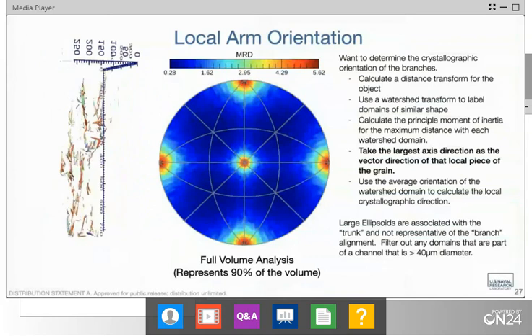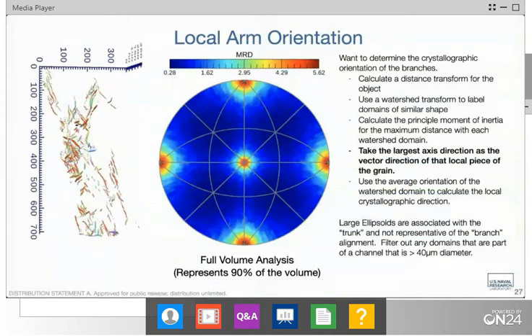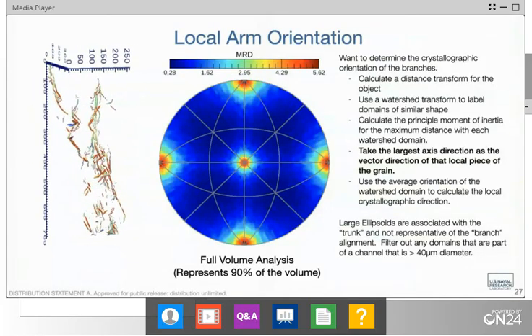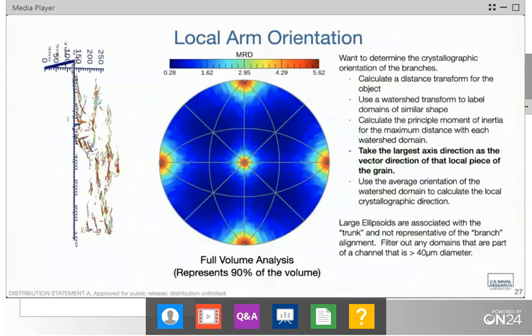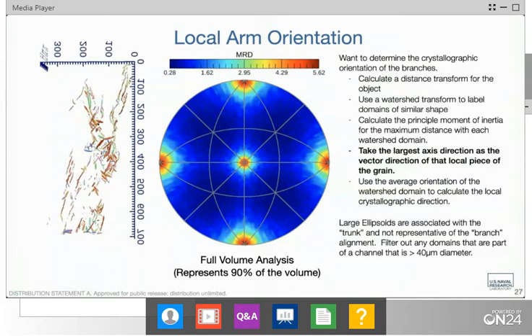So I am seeing a few. I'm going to start here at the beginning. First question. Can the polishing with fiducial marks really be called simple, as you need to renew the fiducial marks for every few slices or so? That's a very valid point.